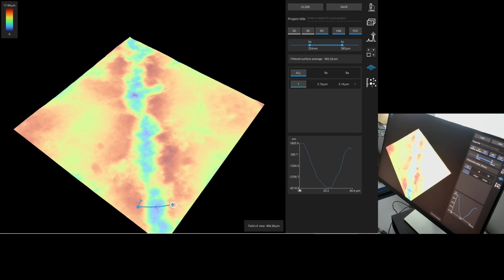It is 424. That's 6 microns. Off to the flat surface, yeah. Now, what would cause this kind of channel? It's flat here, raised on the edge, goes down, raised on the edge, and then goes down to the same level.